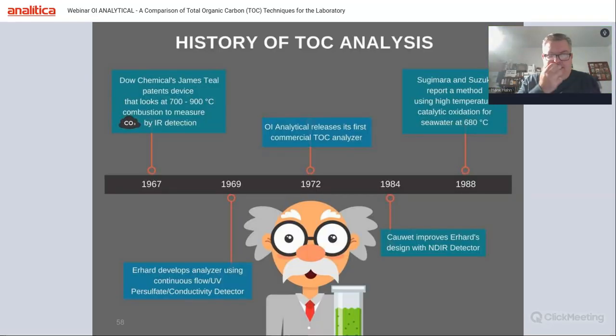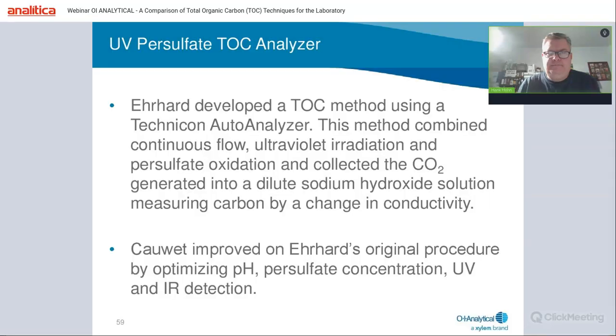And so back to the timeline, where we had discussed this again covers the development from wet oxidation and combustion. This is just a little bit more info with regards to UV persulfate.